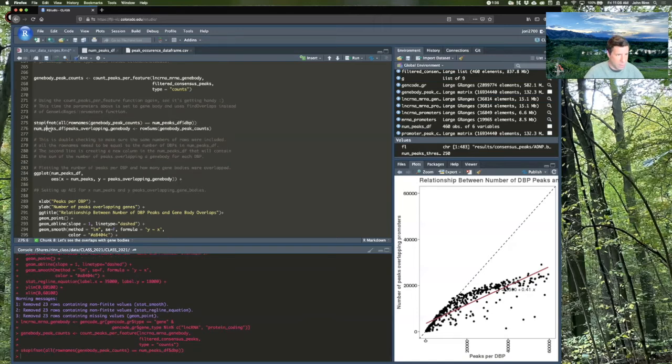So it's not an issue, and stopifnot is a base R function to check your files and make sure they're the right lengths. We'll see why that's more important later in the class.